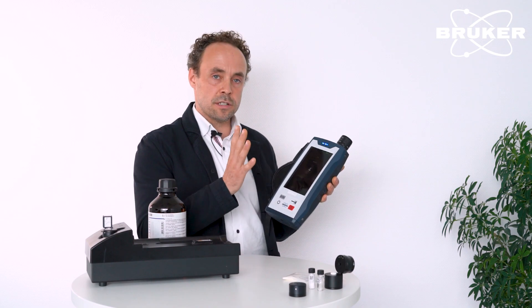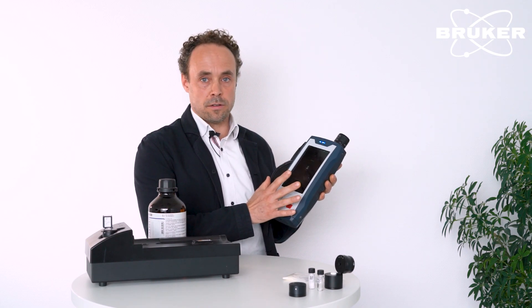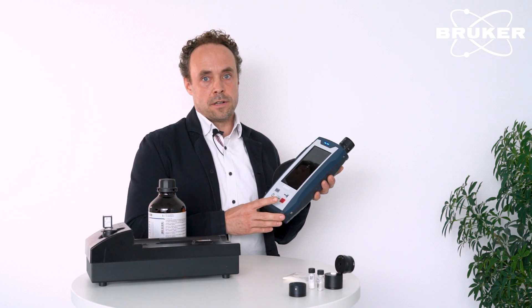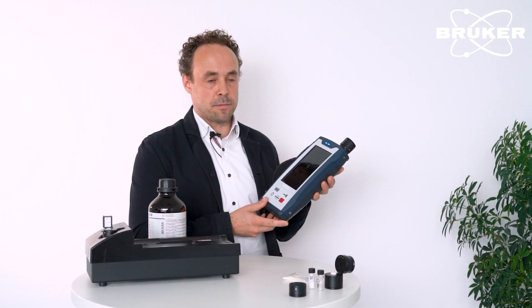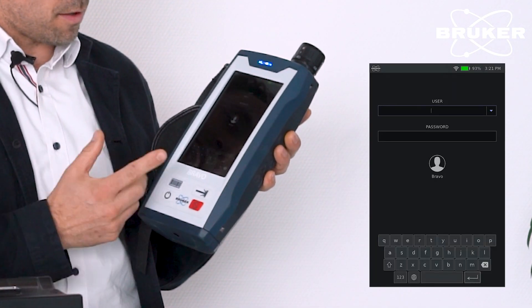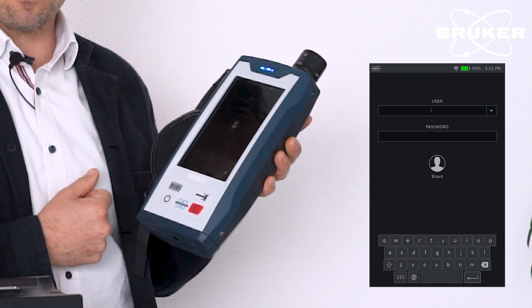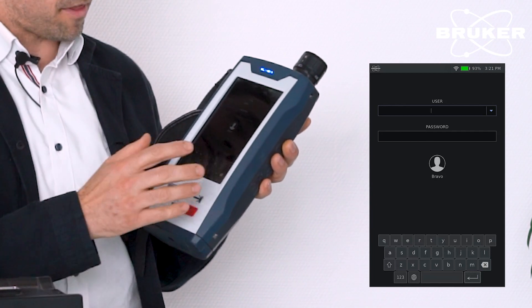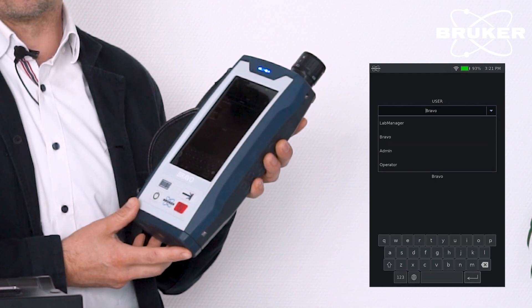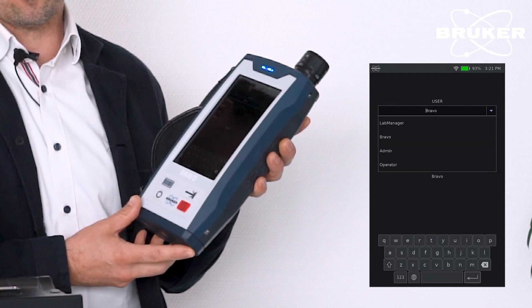The operation is all based on this touchscreen, very easy to use, and the software is all built around compliance to pharmaceutical regulations. Starting the operation of the instrument, of course we have to log in and authenticate. The device supports multiple user roles to ensure segregation of duty.